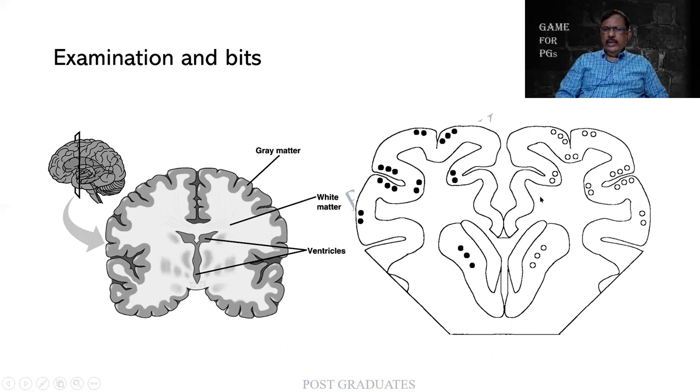And as I told you earlier, you can see the lesion, you can feel the lesion, you can compare it with the MRI, or sometimes it can correlate with the clinical history.